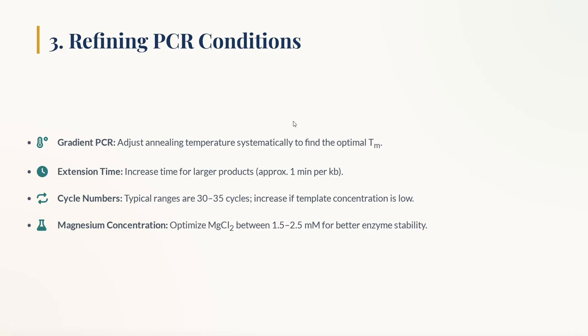Okay, along with this, when do you need to use this denaturation temperature gradient? That is one question I want to ask you. So let me know in the comments if you know when you should go for a denaturation temperature gradient, and let's see who can answer that, right? And if you are not able to answer, you can also ask me in the comments, I'll answer that.